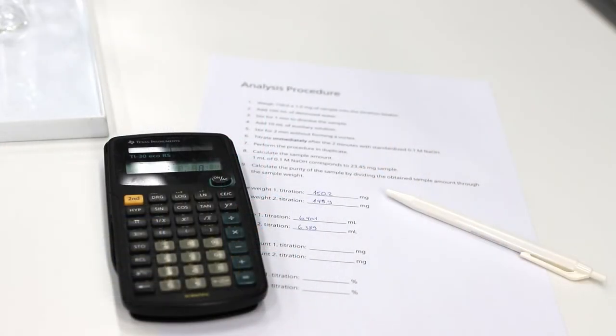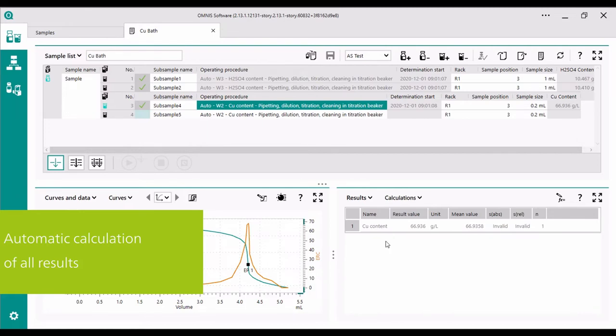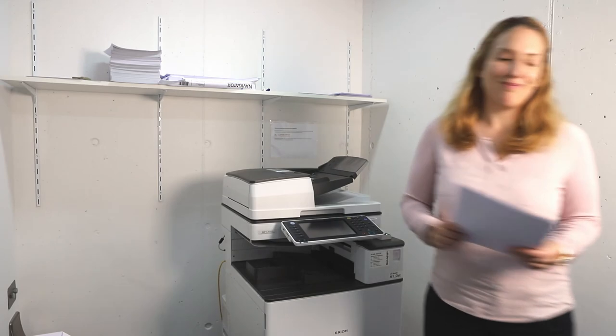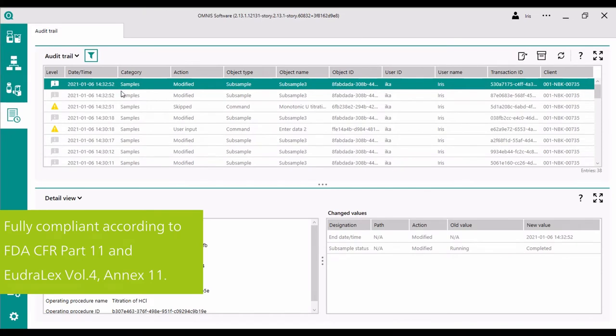After the titration is completed, I need to calculate the result and document it. With an automatic titrator, this is all done by the instrument itself. This is my reason number 4 why I switched to automatic titration. You don't have to calculate the results manually — the titrator will do this for you and display the results together with the titrant volume. Then you can print out the result, save it on a memory stick, or send it directly to your LIMS system for documentation. If you are working in a regulated environment, all steps, all changes, everything is documented, ensuring full compliance and data integrity.